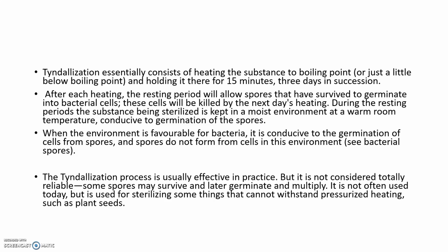When they germinate from endospores into bacterial cells, these cells can be killed by the next day's heating. During the resting periods, the substance being sterilized is kept in a moist environment at a warm room temperature, conducive to germination of the spores.